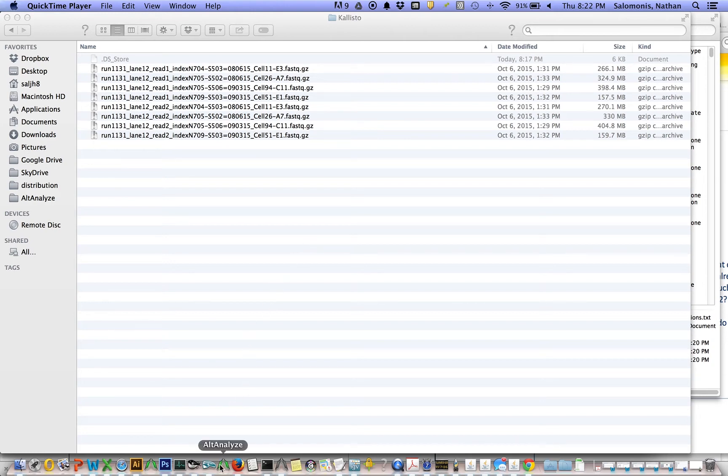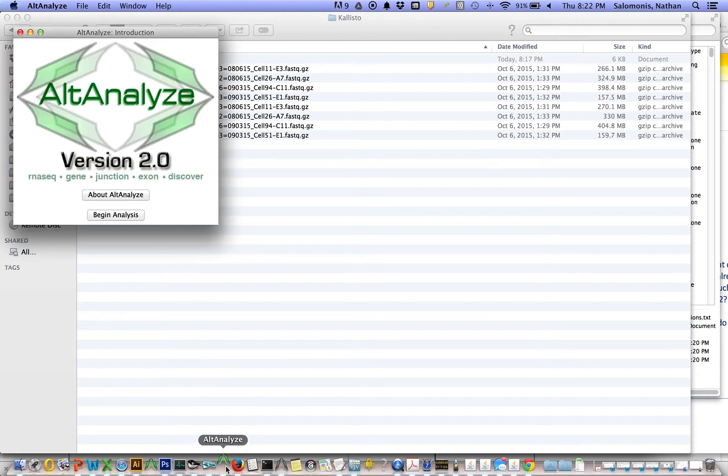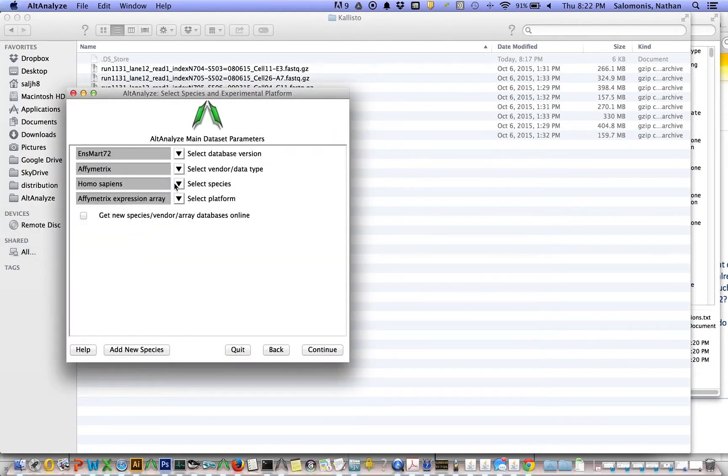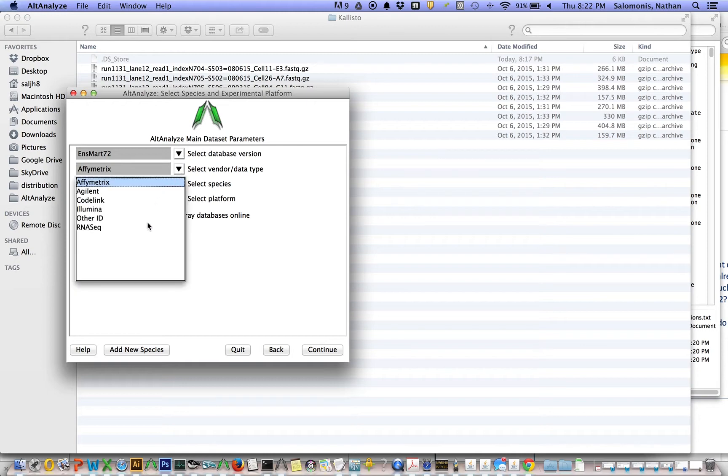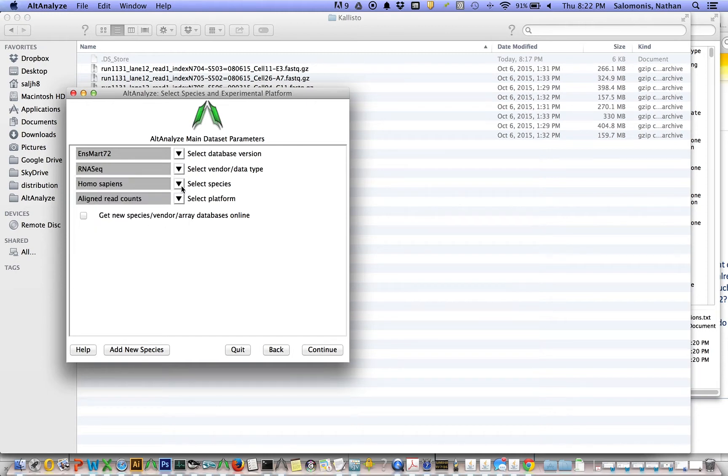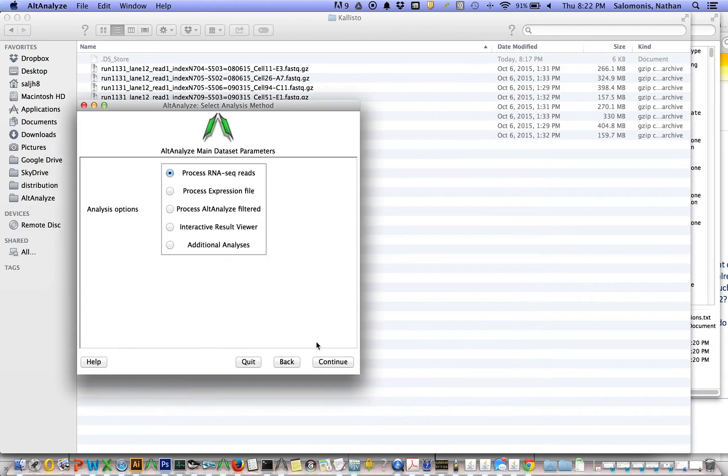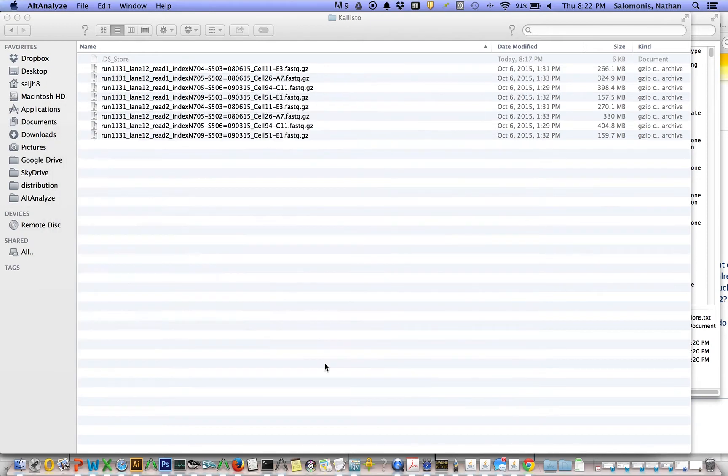If you've already installed AltAnalyze, you'll simply select it. Here I'm on a Mac. I say begin analysis. I'm going to select RNA-seq, in this case mouse, continue, process RNA-seq reads.